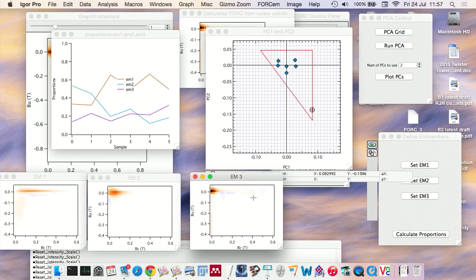Okay. Yeah, question. Here you suppose that there is no interaction between? Yeah. So the inherent assumption here is that these are independent components inside your rock, and this is a good assumption for most rocks, where you have a mixture of this mineral and this grain population and this grain population.